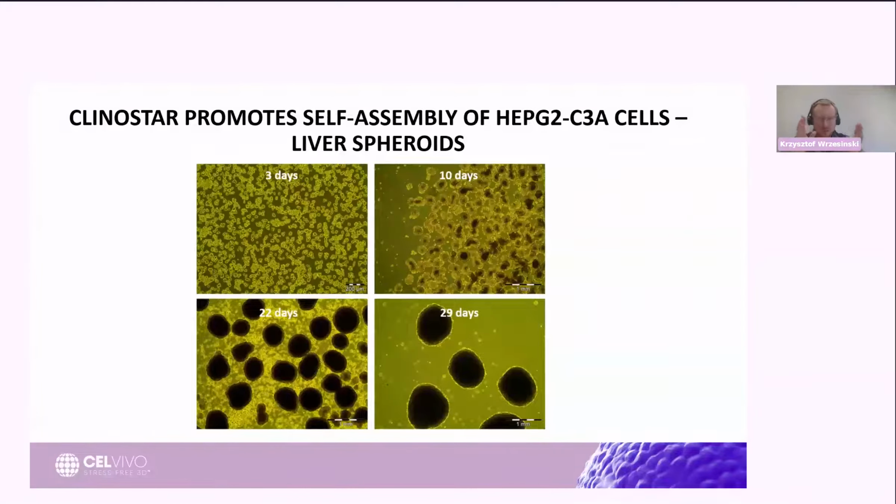And if you want to be extremely accurate, because we have a rotation, we actually have a bit more than 1G, but this bit more is something after the third zero after the comma. So it's a very low additional value. So I would say we can simulate some aspects of microgravity. So that's how it should be called: simulation of some aspects of microgravity.